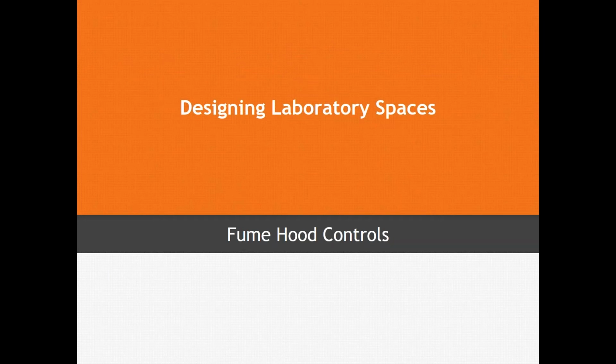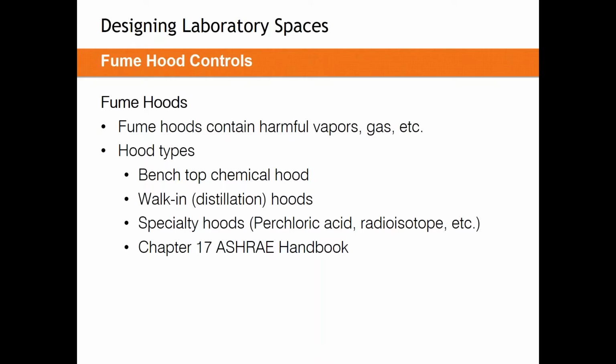So let's look at that primary containment device. Let's look at fume hoods. Remember, the job of a fume hood is to contain harmful vapors and gas. It's to contain effluent in that space. Most experiments and chemical reactions and things like that should be performed right inside the fume hood. If that fume hood is working properly, and don't forget, if that fume hood is used properly, generally speaking, the people in that space will be safe.